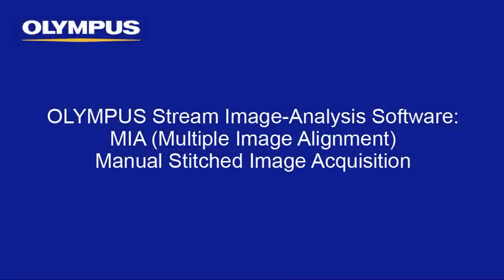This tutorial is one of many instructional videos presented by Olympus Industrial Equipment. This tutorial video will provide you with detailed instructions to perform multiple image alignment, or MIA, by using manual stage control within the Olympus Stream image analysis software.